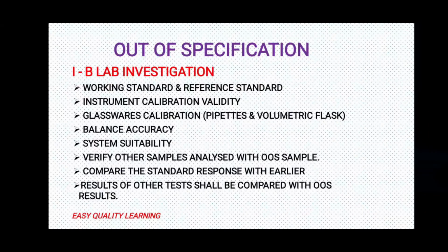We need to check the system suitability reports, and we need to check the system suitability parameters also, whether the system suitability parameters we were getting historically are matching with those parameters, or whether there are some changes in the parameters that we need to verify.